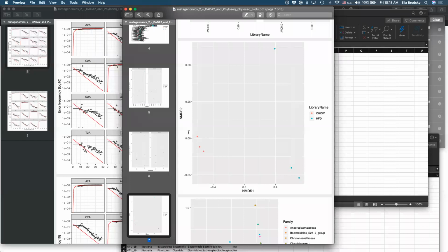A question: how is the abundance of one particular bacteria calculated? What we did here is based on family, so what we are looking at is how the abundance of a family is calculated. You have reads, and those reads combined together are what would be called depth or coverage.